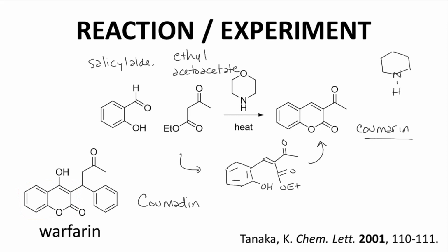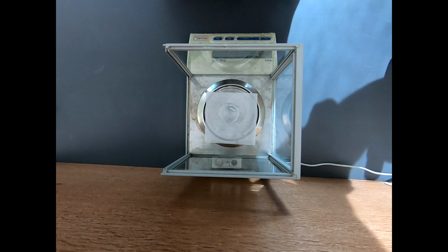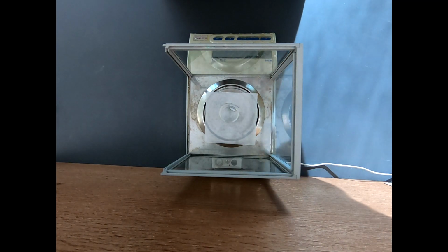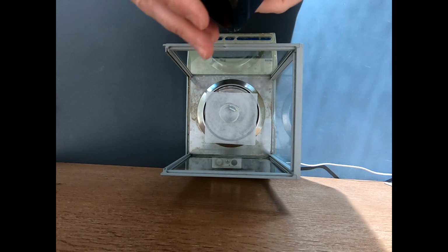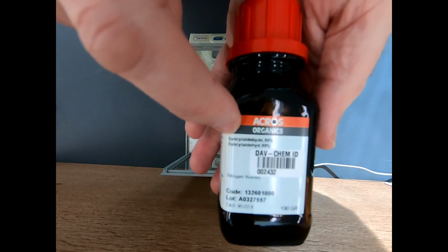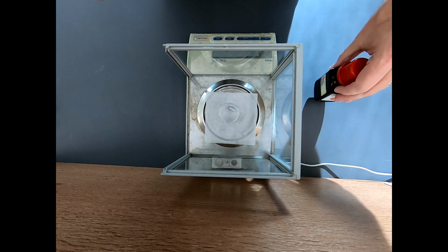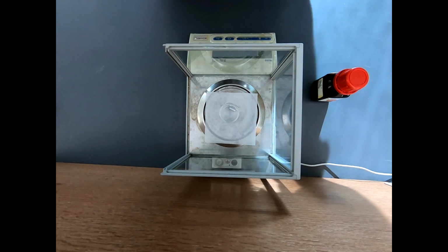Okay, let's see this Knoevenagel condensation. All right, it's always good to be at the balance. Let's go ahead and get this reaction set up. So I have our first reagent. This is salicylaldehyde, and this is a liquid, and we're going to weigh this out on the balance.